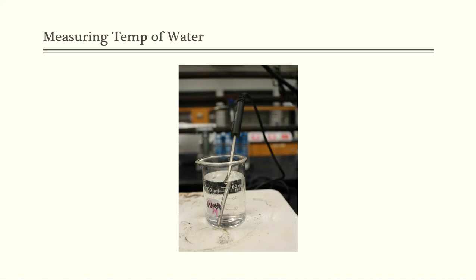Here, I basically took one of our Vernier temperature probes. I put the temperature probe inside of the solution, and this probe is connected to a LabQuest 2 device that's over on the right-hand side, and you'll see that in just a second. This will allow me to constantly measure and monitor the temperature of that water as I begin to heat it. I can go old school. I can use old thermometers that are alcohol based. All the mercury-based thermometers are now out of the water, and we really can't even find those too much anymore. So they are alcohol-based thermometers. If I have those, I can use them, but quite honestly, this is a very simple, quick plug-and-play device. Plug it into the LabQuest and go about your business, all right?